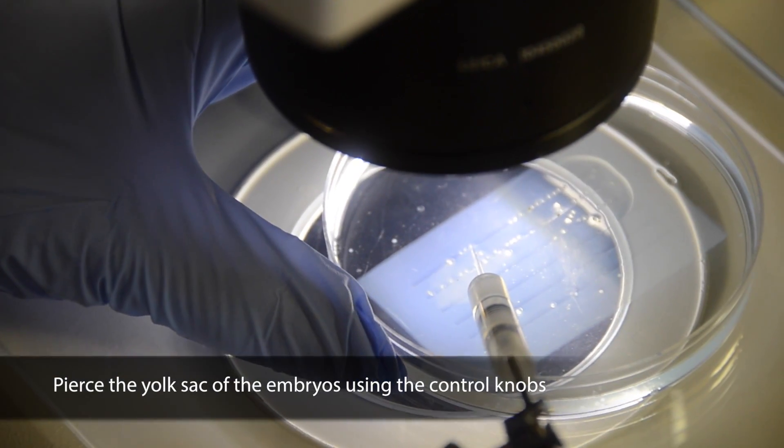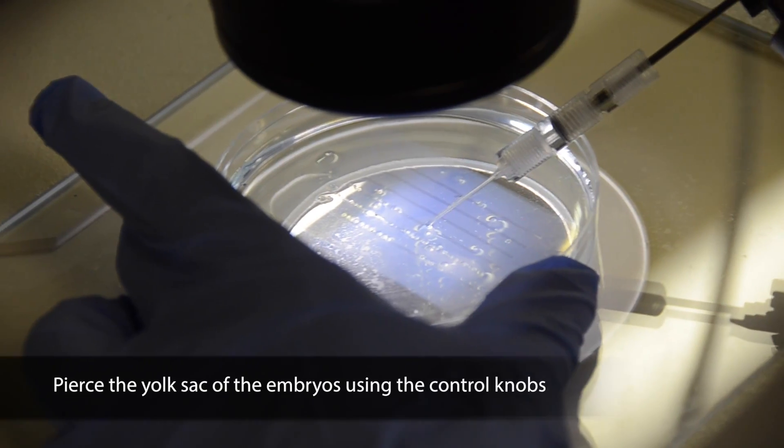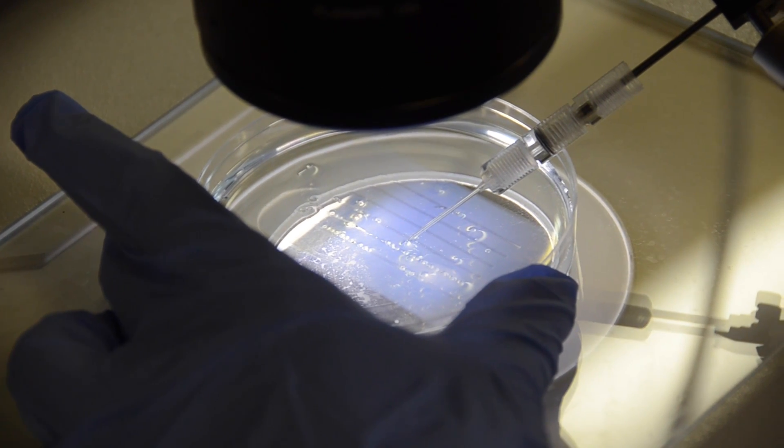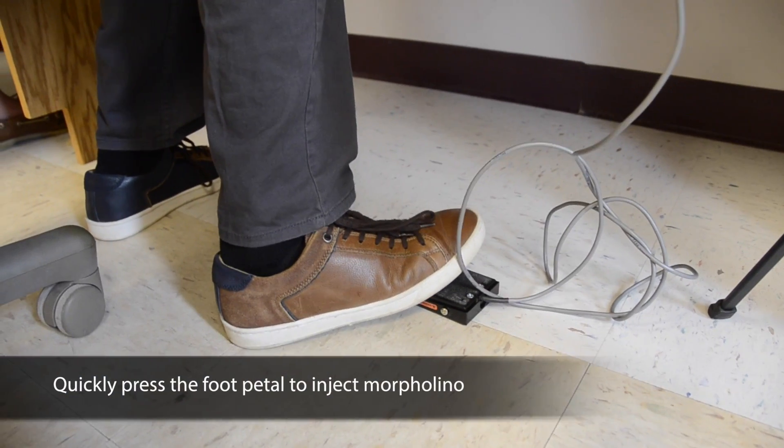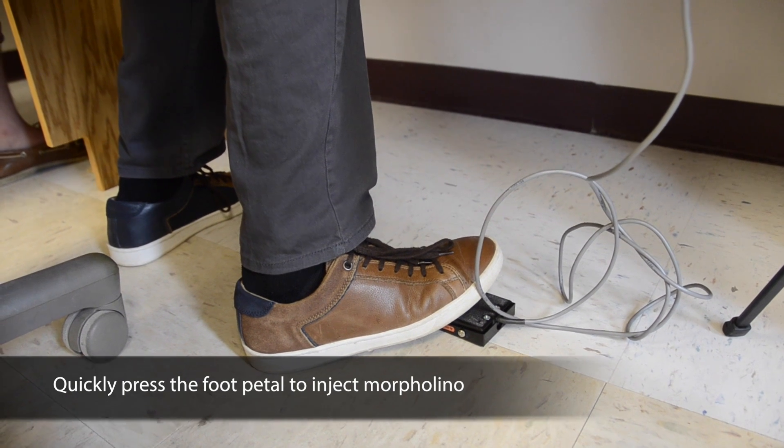Watching through the microscope, pierce the embryo using the knobs and make sure the needle goes into the yolk sac of the zebrafish. Press the foot pedal. This injects a small amount of Morpholino into the embryo.